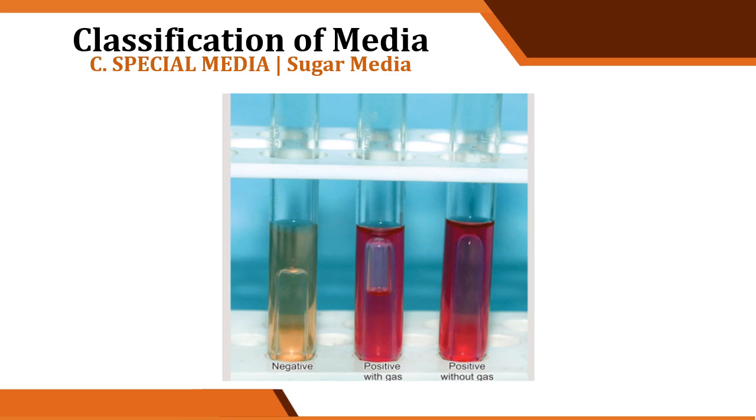Meron din naman tayong tinatawag na serum sugars. Okay, these are used for organisms which are exacting in their growth requirements. Okay, like streptococci or pneumococci.